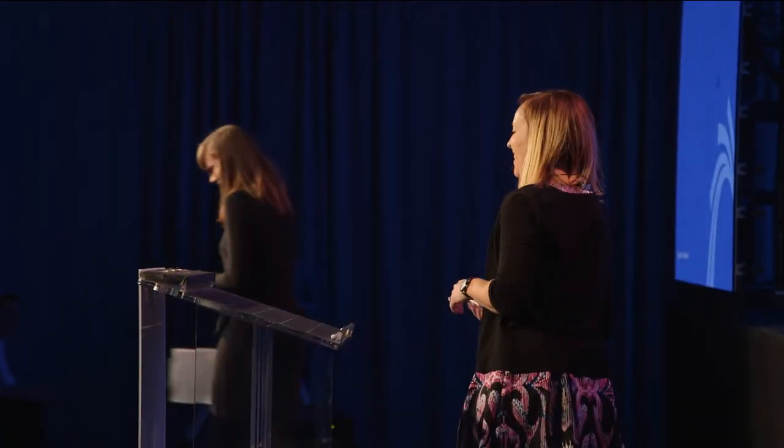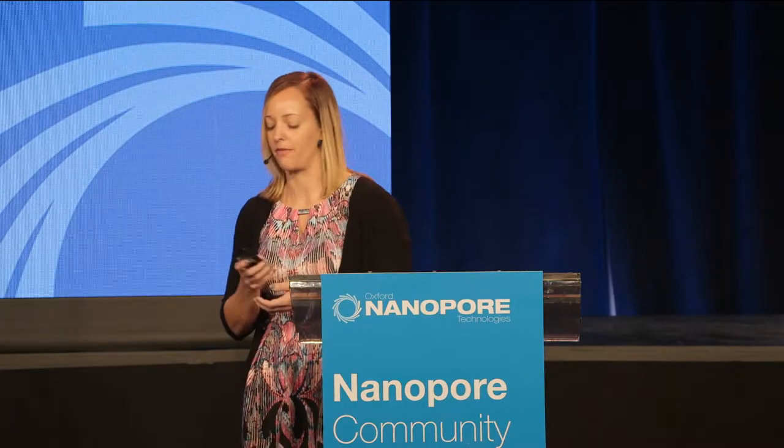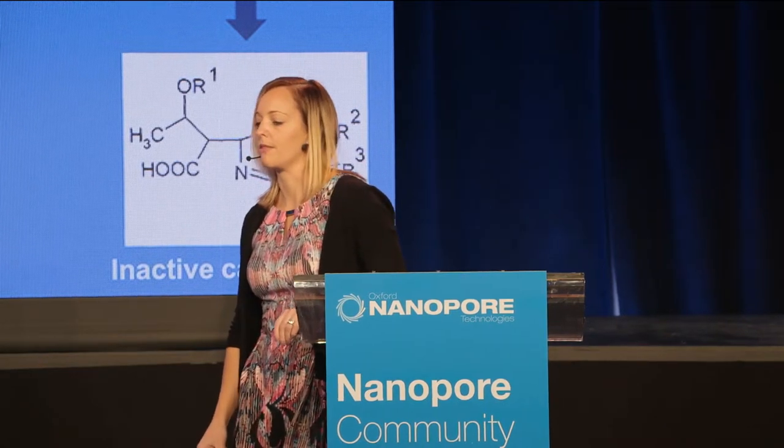Good morning, everyone. I'm excited to be here this morning. And today I'm going to be talking to you guys about some fun stuff that we've been doing with nanopore sequencing to address the threat of carbapenem-resistant gram-negative organisms. Greater than 700,000 people around the world die from antibiotic-resistant infections. And one of the most significant are carbapenem-resistant organisms.